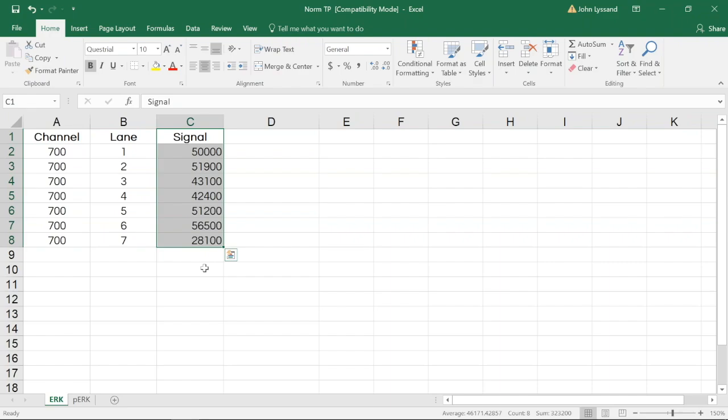As we examine these values, we're going to want to find the lane with the highest signal value. In this example, we can see lane 6, shown here, has the highest value compared to other lanes.